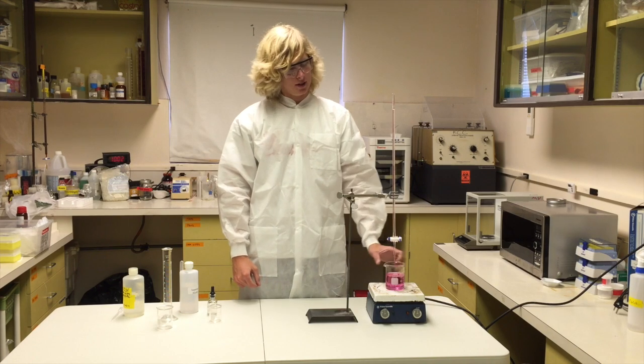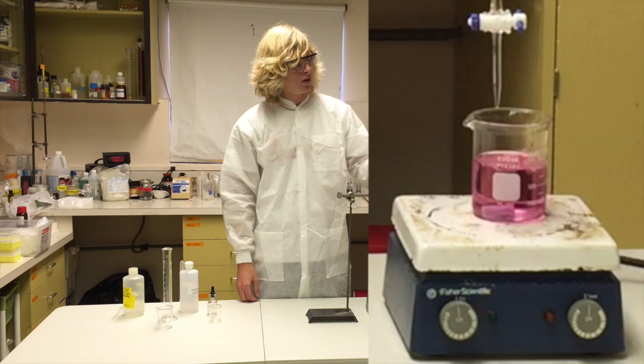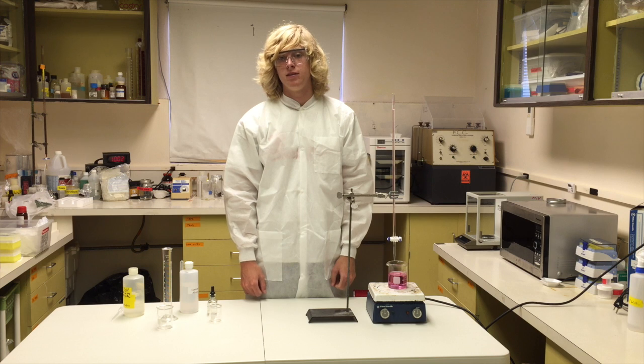So it's been over 30 seconds. You can see our solution is still a bright pink magenta color. We noted the amount of potassium hydroxide it took. It was 0.15 milliliters. And we're going to record that as the value A for our calculations.